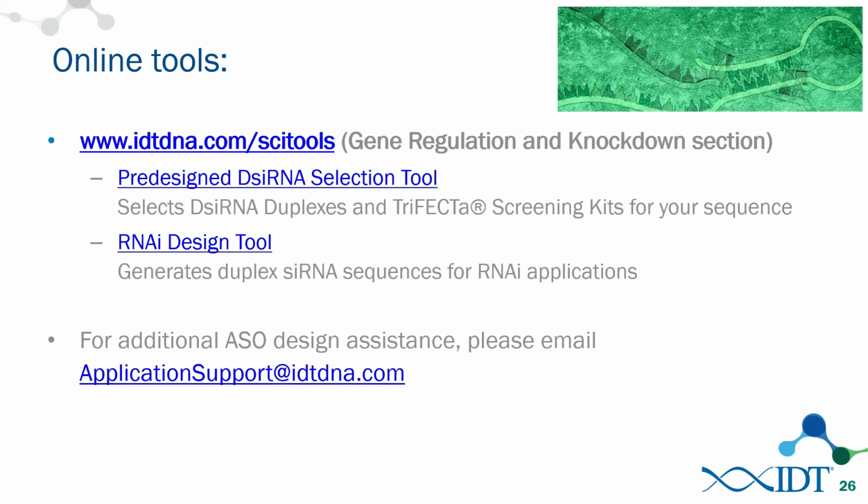Okay. And you know what, I have designed antisense oligos for customers targeting introns, and they have worked successfully. So while I have not done those experiments, I have had customers tell me that they've had success with it. So it's possible, and there should be some published data out there somewhere.